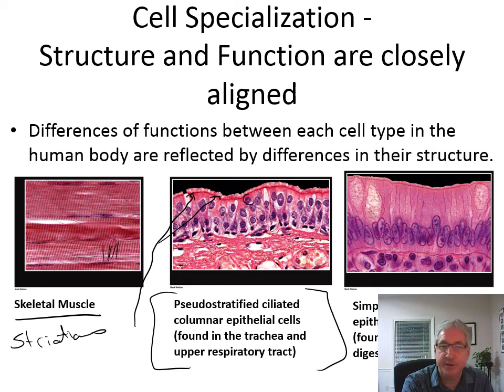And each of these round balls, that's a nucleus, that's a nucleus of a cell. So there's a cell, and there's different cells in here. We'll talk about this when we get into tissues. We'll talk about what this looks like. So those are all different cells.